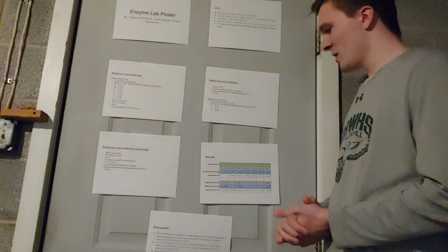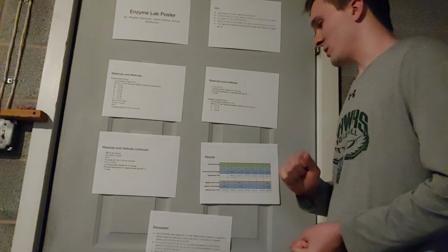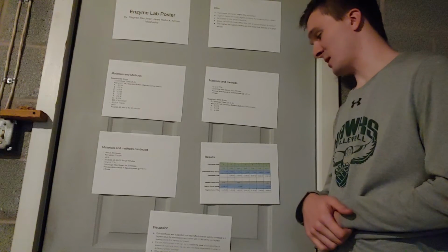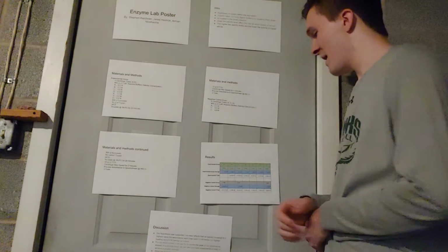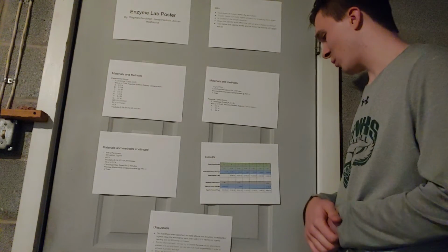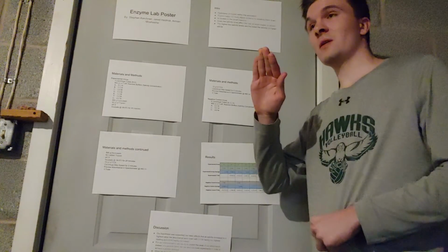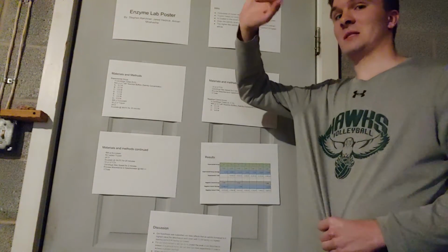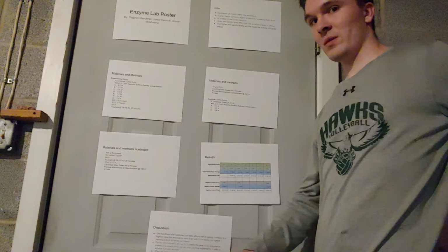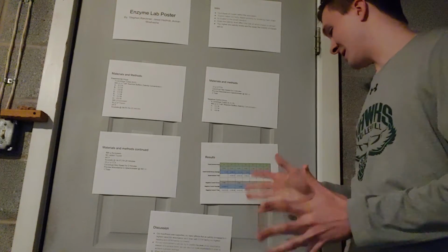For our results, we can see our hypothesis was roughly correct. For 0, we had the highest absorbance at 0.734, and at 4.8, our highest salinity, we had our lowest at 0.36425. In the middle, there are some ranges. It starts to go up a little bit, and then you can see it drop and quickly rise again, and then go back down at a slow rate, and then it kind of plateaus once you get down to that 4.8 level.